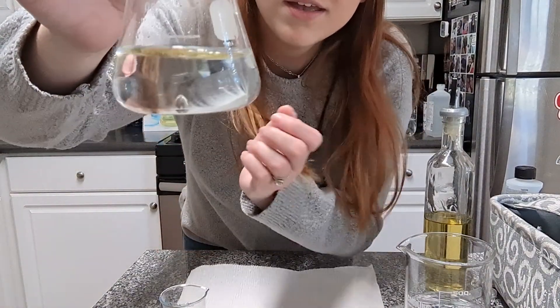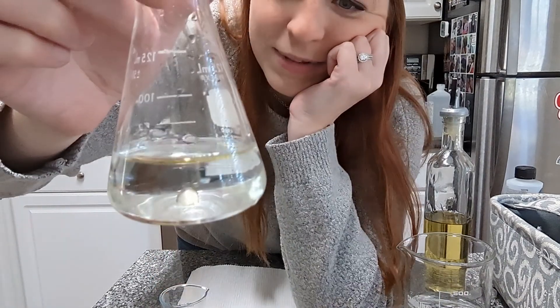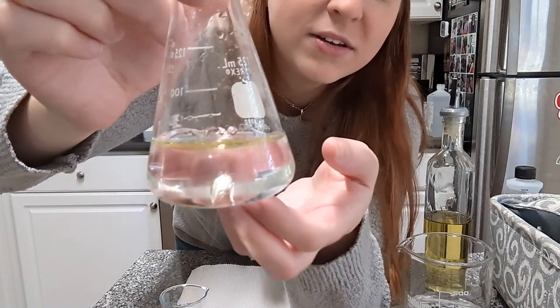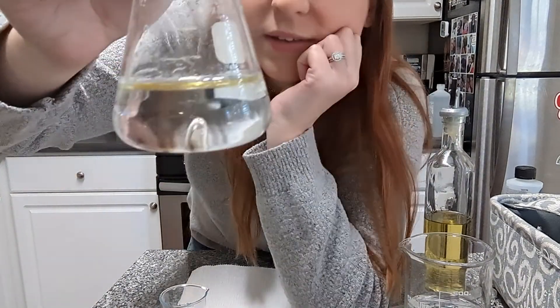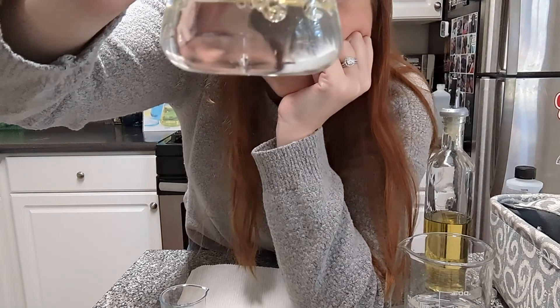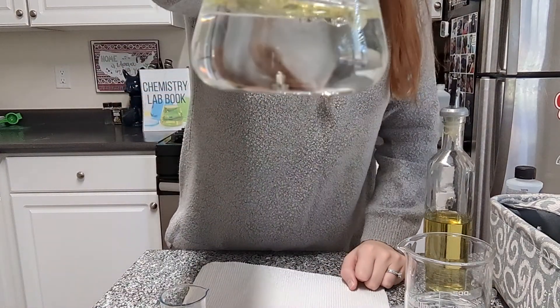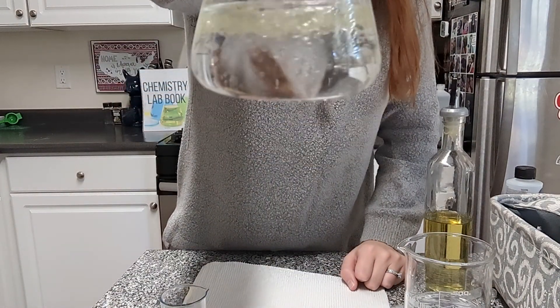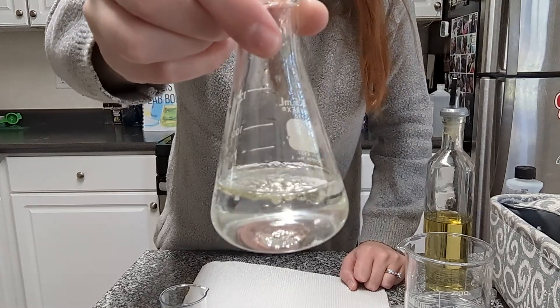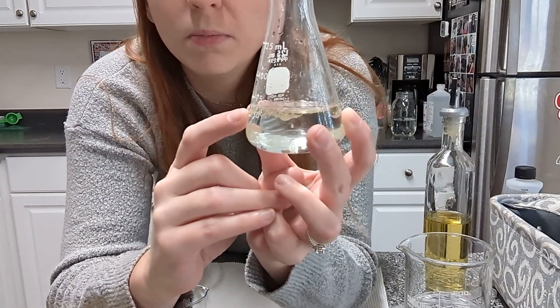Do you see that bubble on the bottom? That bubble right there is a little glob of oil and he's just trying to get up to the top. Clearly this is non-polar. You can kind of see the layer of the oil on the top. Give this guy a swirl. All those little oil bubbles on the top are going to glob together if you let it sit long enough — they're all going to glob together and make one big blob of oil.